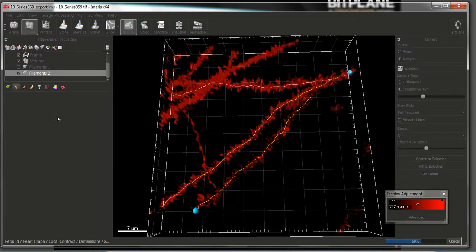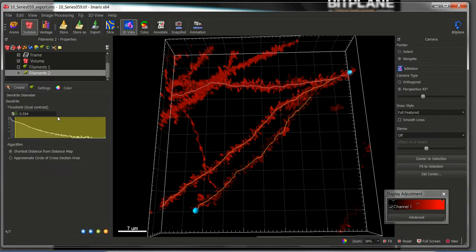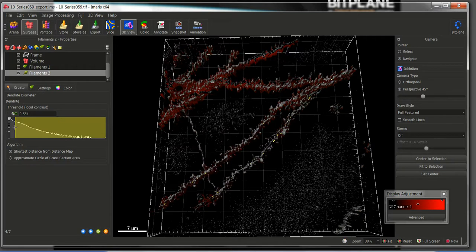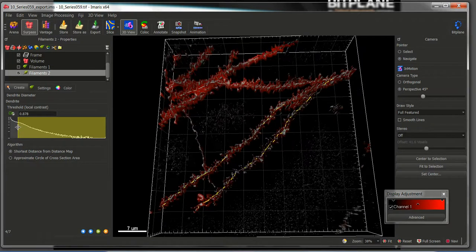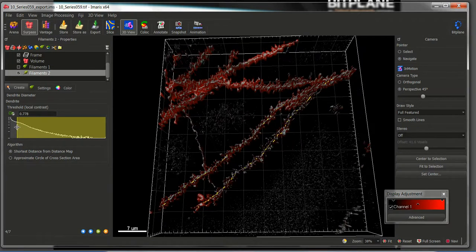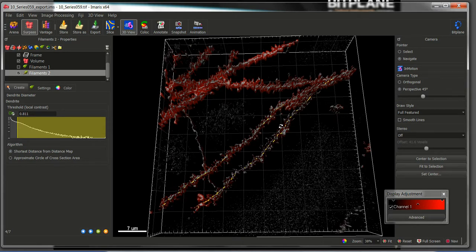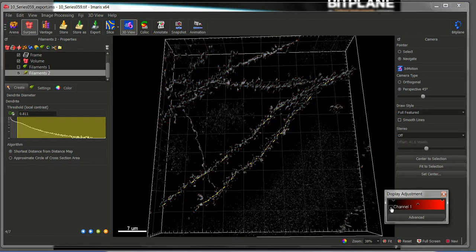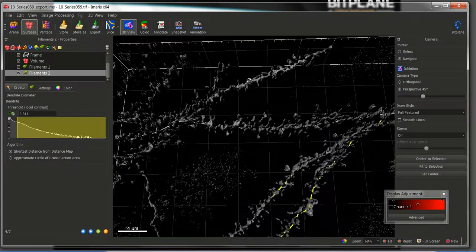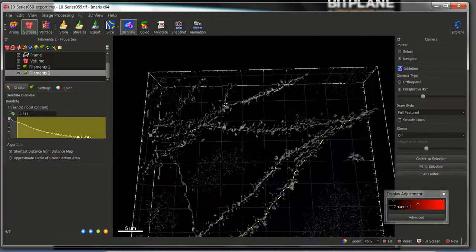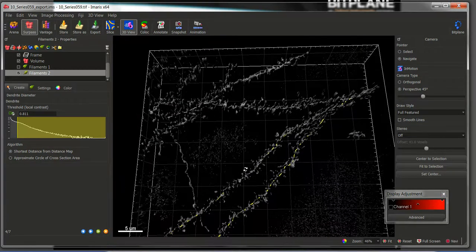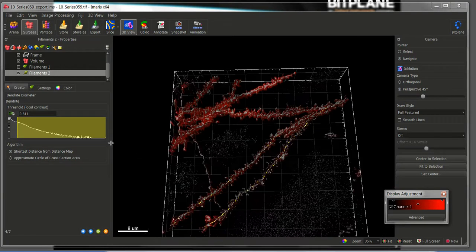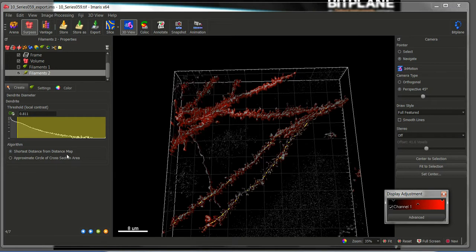This will help us to first adjust the signal thresholds for the detection of the dendrites, so we can have a good quantification of the diameter. Do not worry if we have some signal in these other dendrites, but because they were not drawn previously they will not be segmented now. Select the algorithm you want to choose to quantify the diameter. In this case I will choose the shortest distance from distance map.